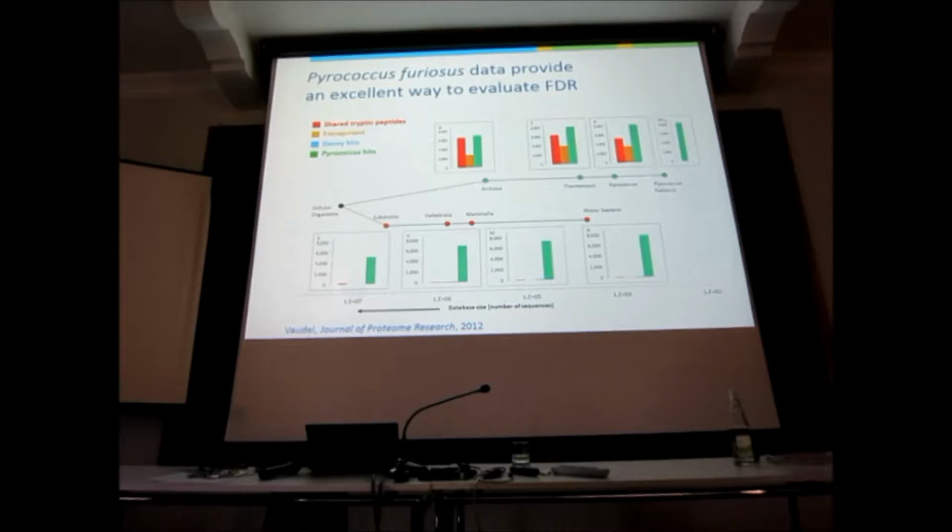Although the peptides, when you look at how they distribute over a chromatographic run, if you look at the mass distributions, they look like ours. Now, why do we use this? We use this as an entrapment database. And the idea is simple.